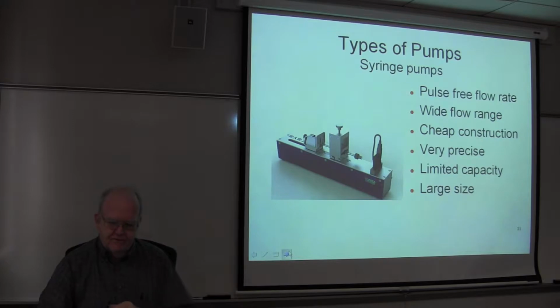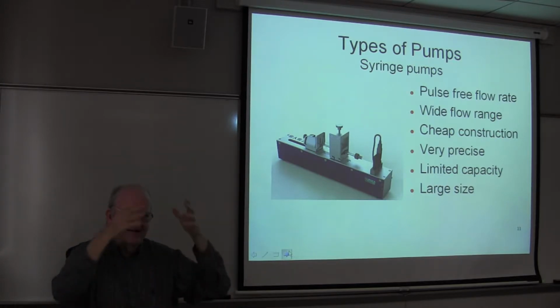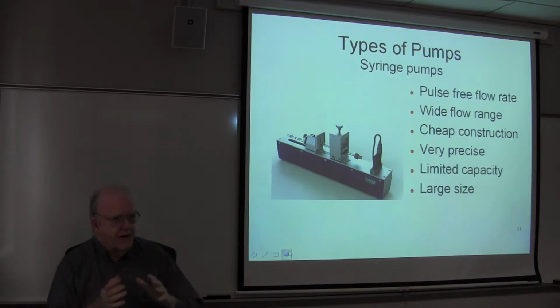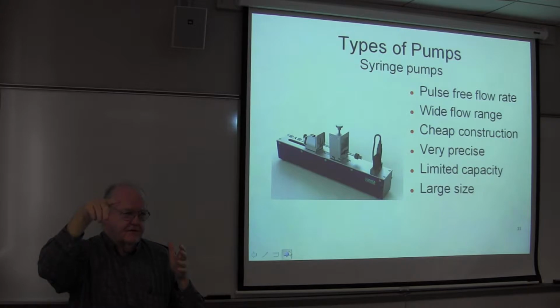These were actually really popular in the beginning days of HPLC, and they had some of these things that had a syringe that would store a liter. The problem with them was that it takes a long time to get that liter fully compressed. It could take minutes to get that compressed, and so the flow rate would gradually increase until you got to a constant flow situation.